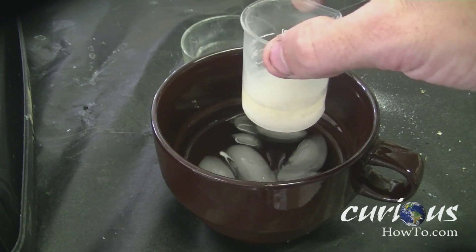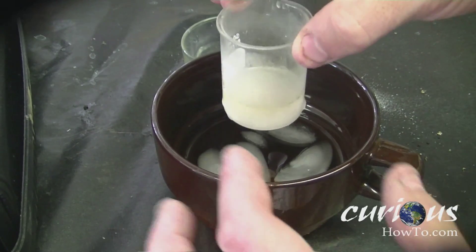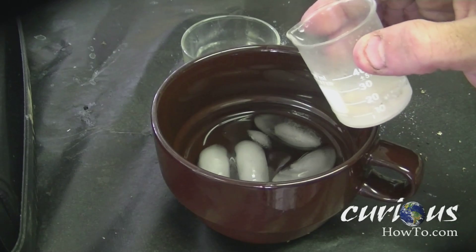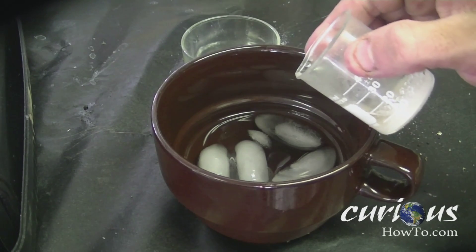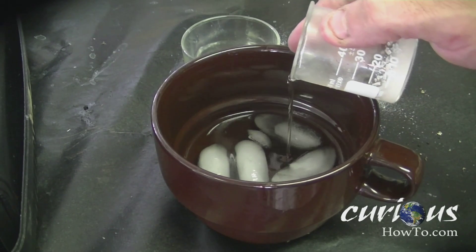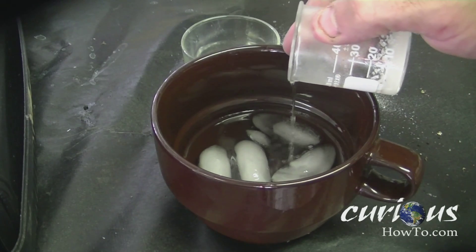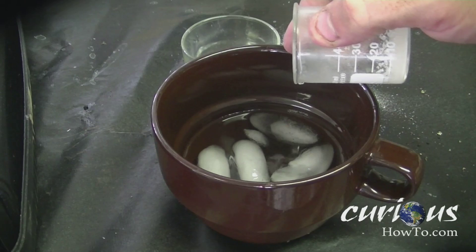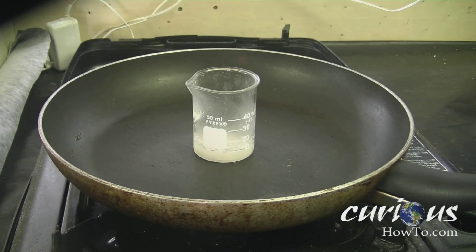Once it is room temperature, you're going to want to set it into some ice water and cool it right down. Now that it has cooled right down, we're going to want to separate the water from most of the solution, so tip the jar and drain most of the water out until most of the water has gone from the solution.